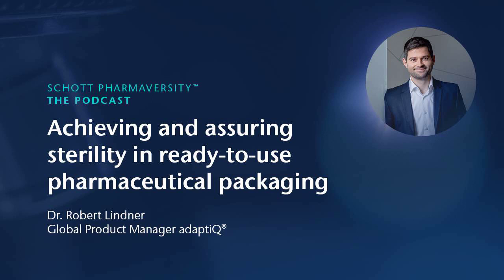Okay, thank you. That's clear. If it can become a life or death influencing factor, it's definitely to be seen as a highly important topic. So when looking at sterility, Robert, can you please let me know where in the full production process we need to look deeper? Is it in the production of the primary packaging itself? Is it more in the handling afterwards, the logistics, the fill and finish? Please help us understand which parts are the relevant ones when it comes to sterility, when you look at the process steps.